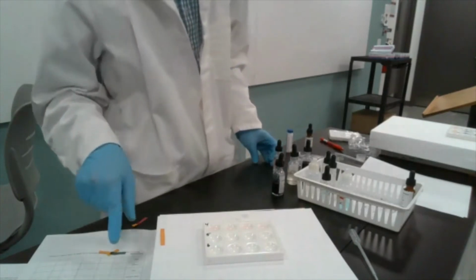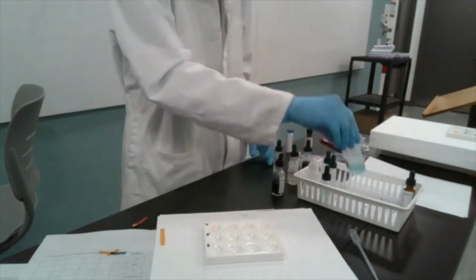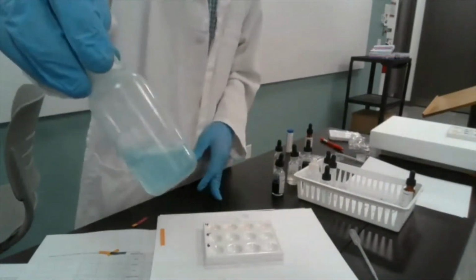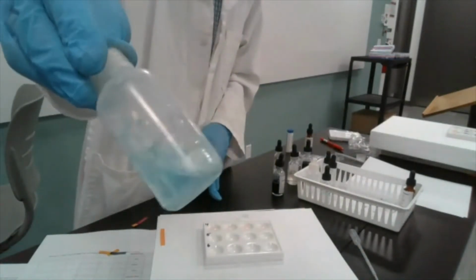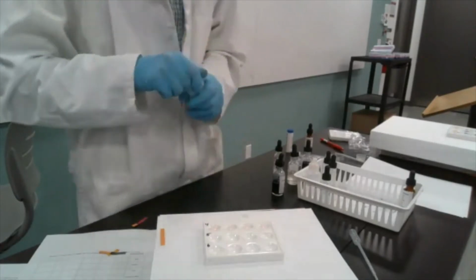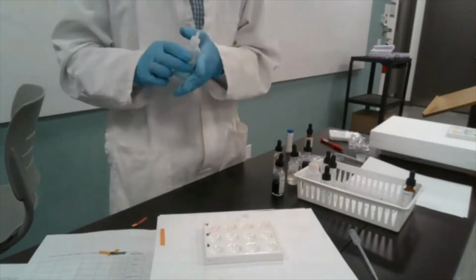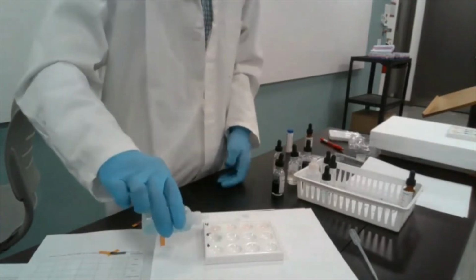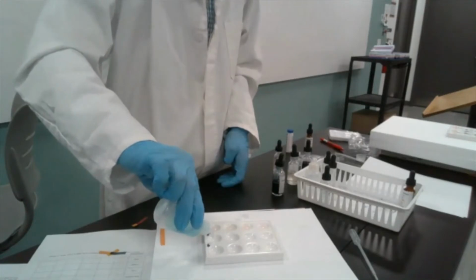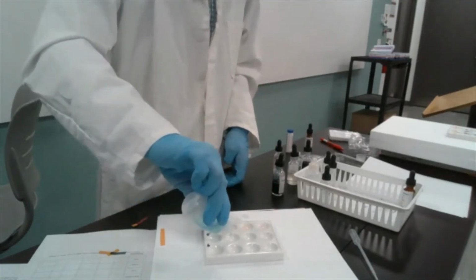Then I'm going to add glass cleaner to the next set of wells. Now you may or may not be familiar with this. You see that it also has a slight bluish color to it, probably so people don't ingest it by accident. But I personally don't know anyone who has ever attempted, but who knows.